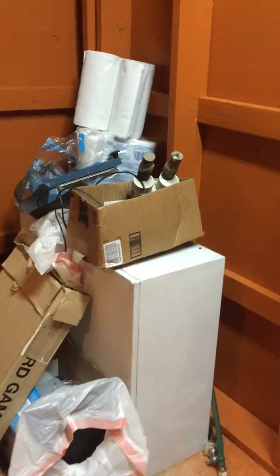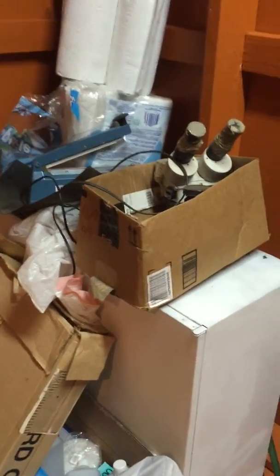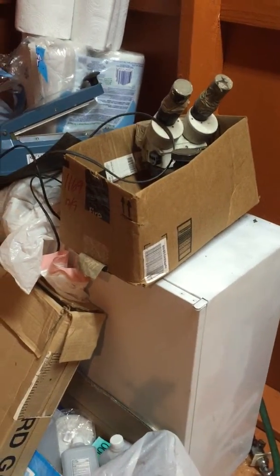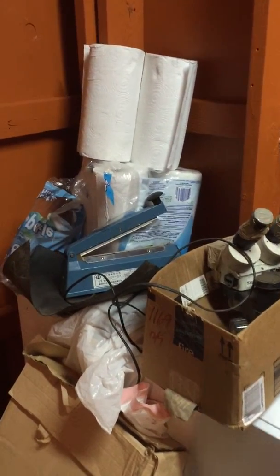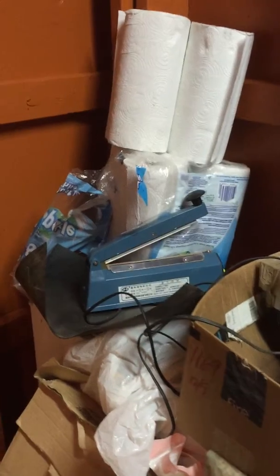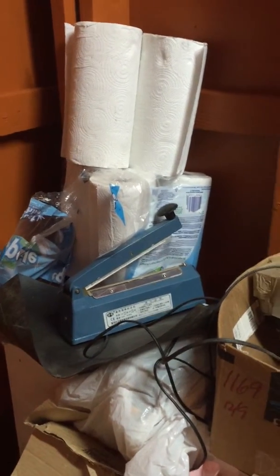My microscope is kind of messed up — I need to get a new microscope. We're going to hang this cabinet here and keep all our basic alcohol and stuff in there. There's our impulse sealer.